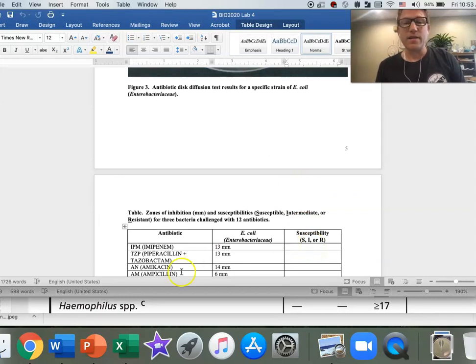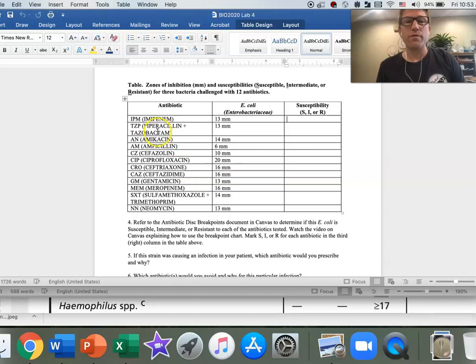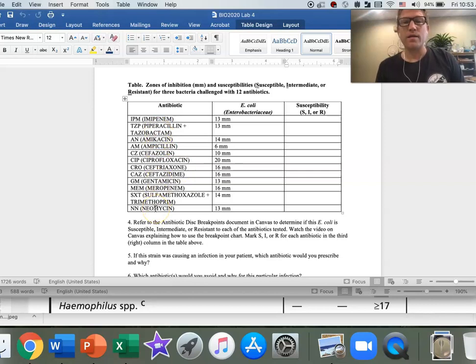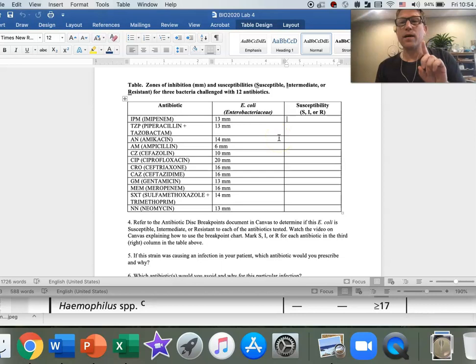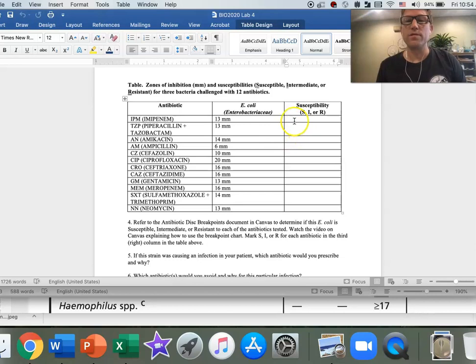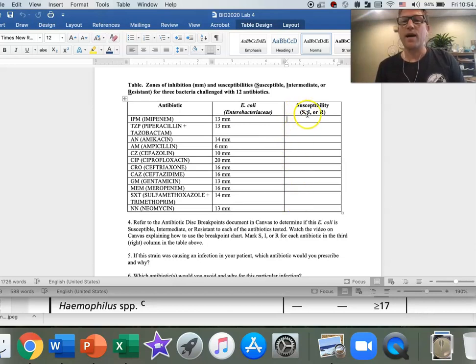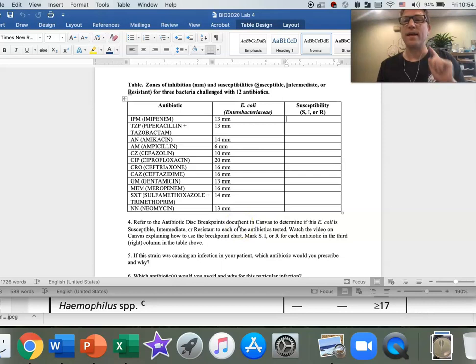Make sense? That's how you're going to interpret it. You're going to work through the remaining 11 antibiotics here. You're going to look them up on the chart. You're going to compare the diameter of the halo to the breakpoints, keeping in mind Enterobacteriaceae is the category of breakpoints you want to be using. You're going to fill in S, I, or R for all of these, and you've got some questions to answer about that. I hope that was helpful.